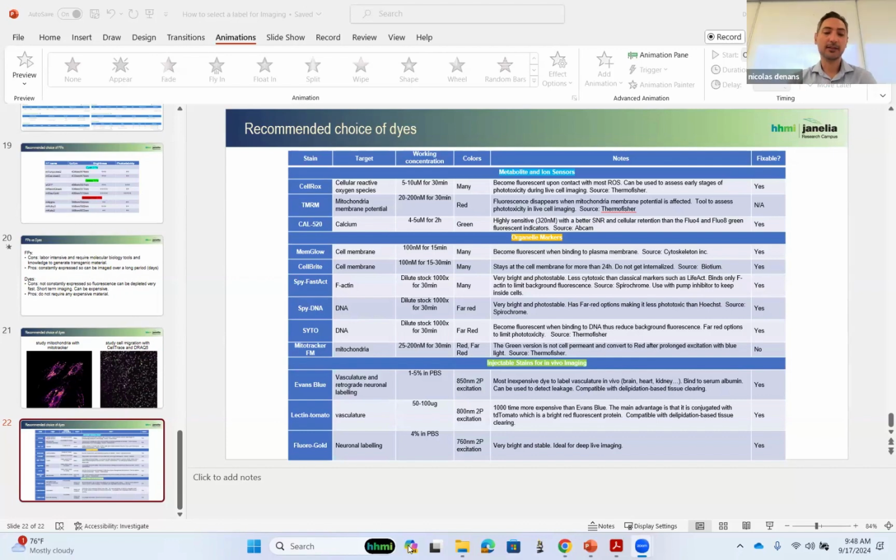Oh yes, definitely. It's the fluorophore by itself. The structure of the fluorophore can be impacted by photobleaching, so they can be more or less sensitive to reactive oxygen species. So, for instance, for fluorescent protein, we know that we need to remove cysteines group to make them less photodamaged. So yes, the structure of the fluorophore itself will impact how much the fluorophore is going to be photobleached.